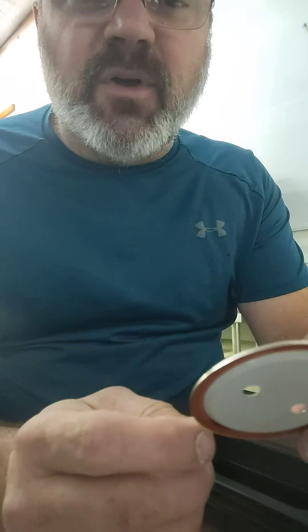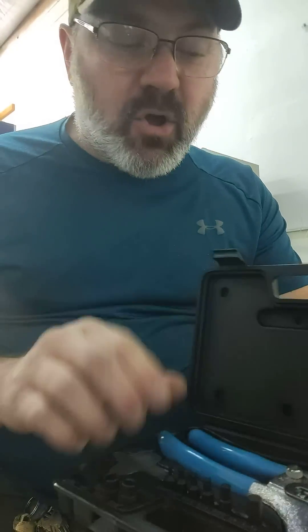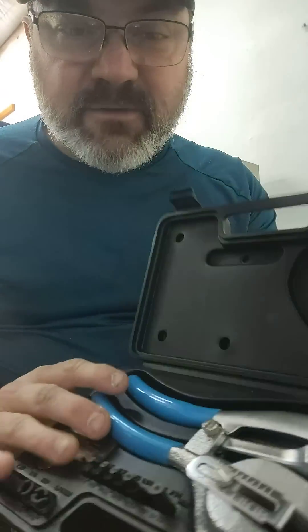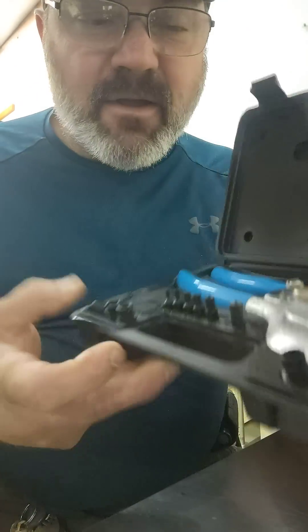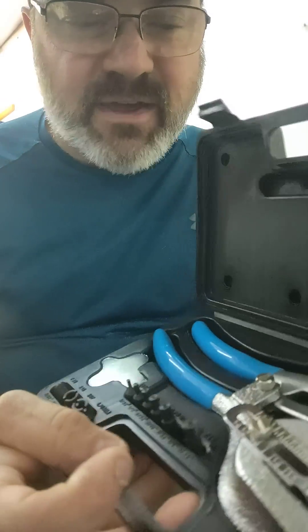I don't use a drill. I use a Capri hole punch. It's got various dies and punches, different sizes. I just set mine up with a quarter inch size.